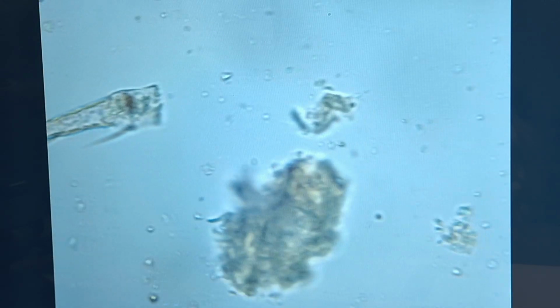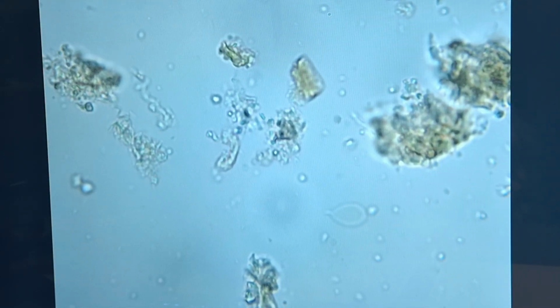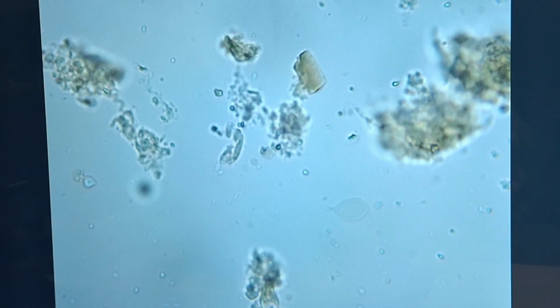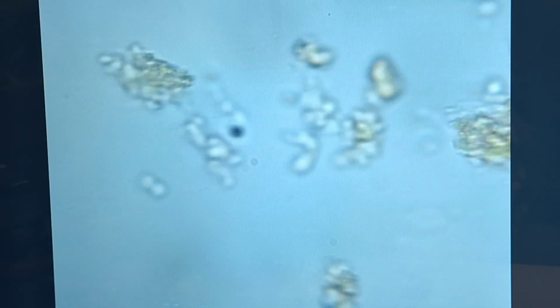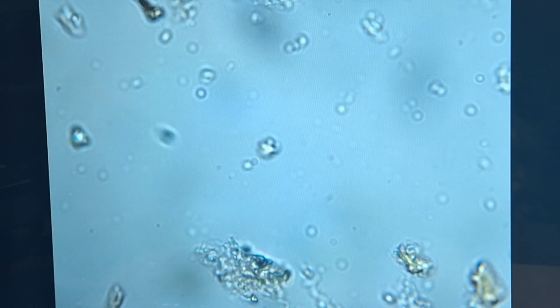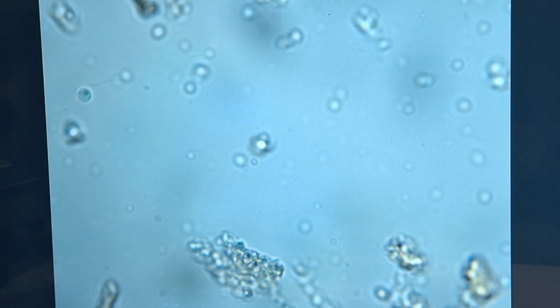This is a really good example. Ooh, very touchy at this magnification. It's a very good example of a flagellate. And that might be another one right there, not moving. A good example of a good-looking flagellate right there. Let's see who else.